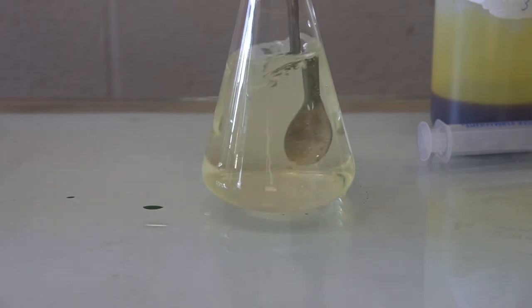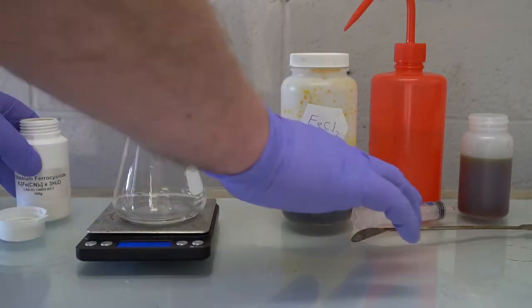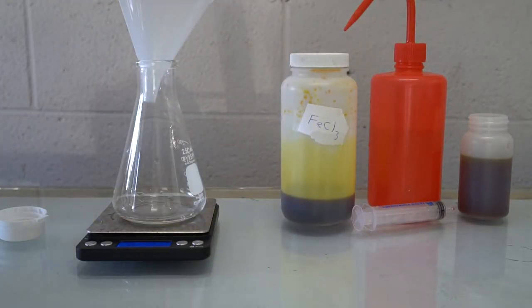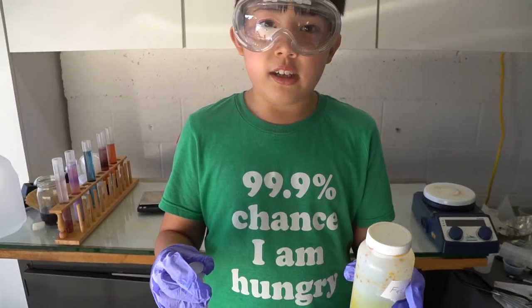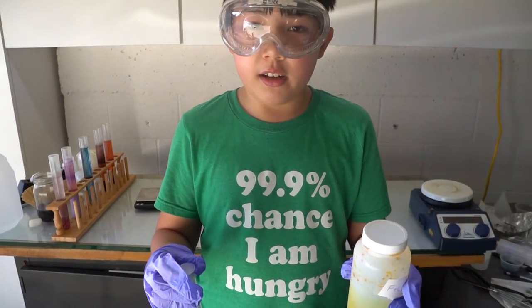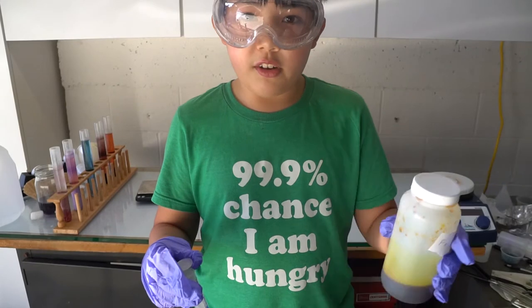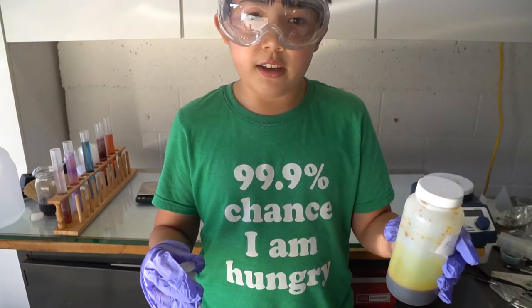Then the ChemTalk lab assistant dripped in our ferric chloride solution with a syringe. Hi, I'm Ryan, the ChemTalk lab assistant. I'm going to add the ferric chloride to the potassium ferrocyanide.